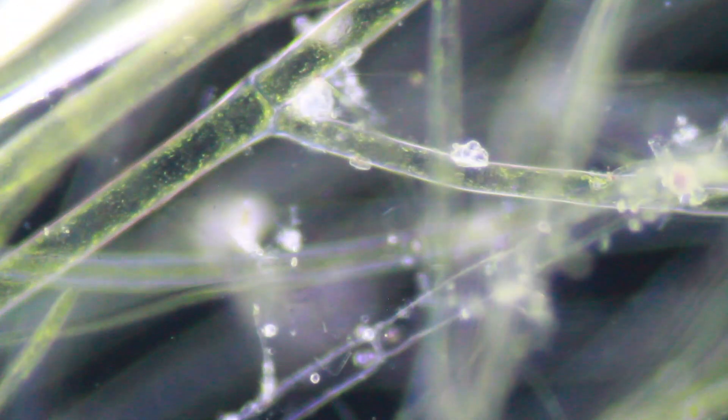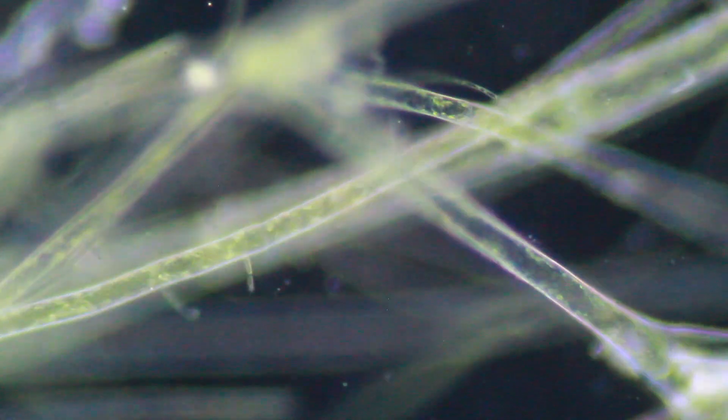Later on I decided to switch back to bright field because the resolution and the clarity is a little bit higher, and also the depth of field is a little bit better. But in any case it also looks kind of nice in dark field, just not so much to see relating to interesting microorganisms.